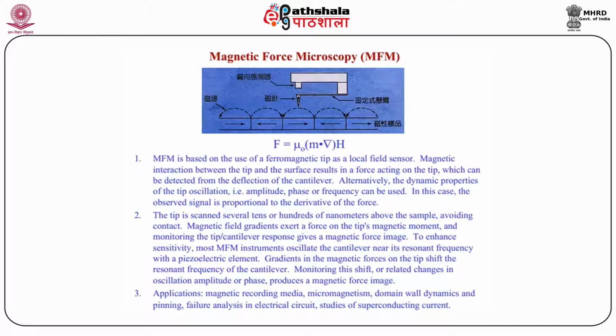Applications of this are magnetic recording media, micromagnetism, domain wall dynamics and pinning, failure analysis in electrical circuits, studies of superconducting current, etc. These can all be analyzed with the help of MFM spectroscopy or microscopy, as we call it.